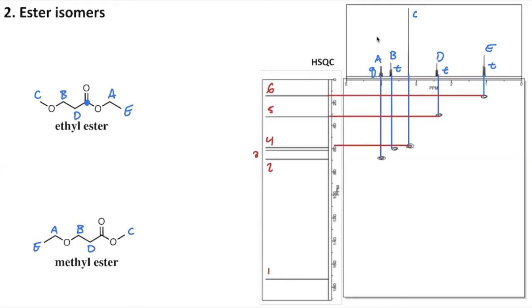Now you can see this is a little bit of a tricky situation here. It looks like carbons 3 and 4 are quite close together, and our lines aren't necessarily super clear there. I think I did pretty well. I am going to try to move these just a little bit. Okay, after a little bit of fiddling, I've done the best I can with carbons 3 and 4.